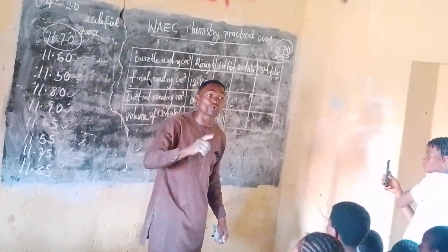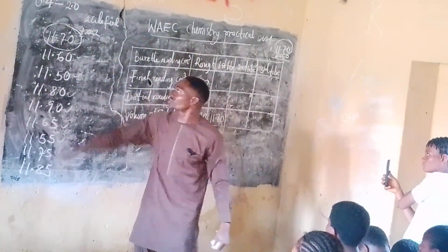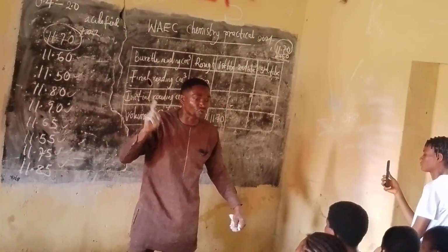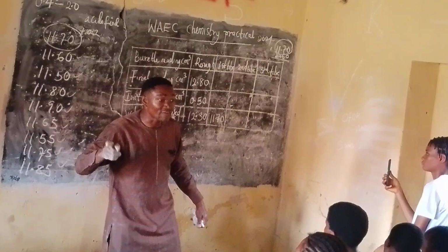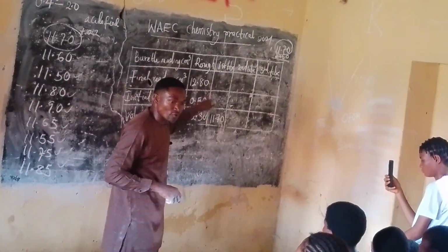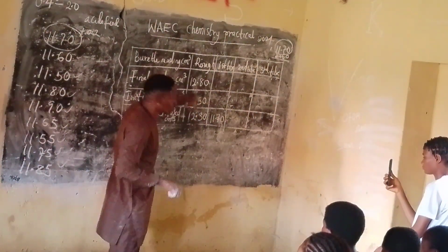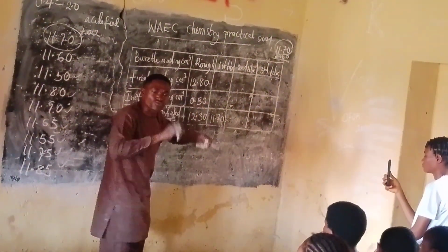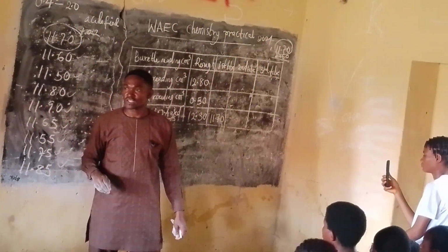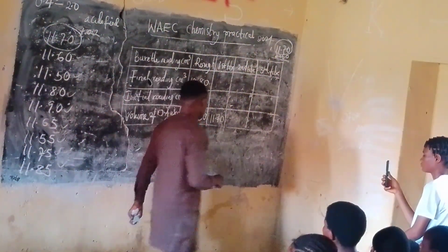No 2 persons table will be what? Exactly the same. Because you could choose to form your rough with 0.4, that person could choose to form his rough with 0.8. Giving 1 to be added to the main value to get rough, and then added together to move on. You understand? So that will make the values not exactly the same. Is that clear? Alright, so we'll go ahead.